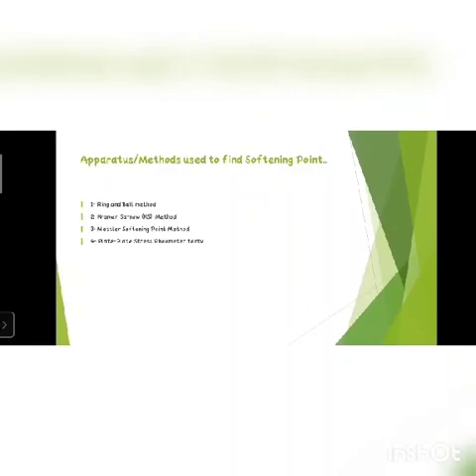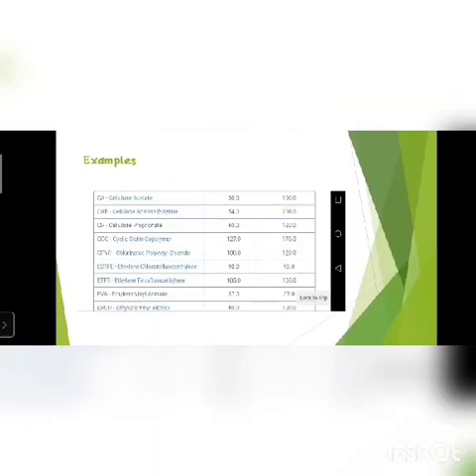Next, we will look at some examples. These are polymers that show different softening or heat distortion temperatures at a specific load of 4.5 bar, or 0.45 megapascal.